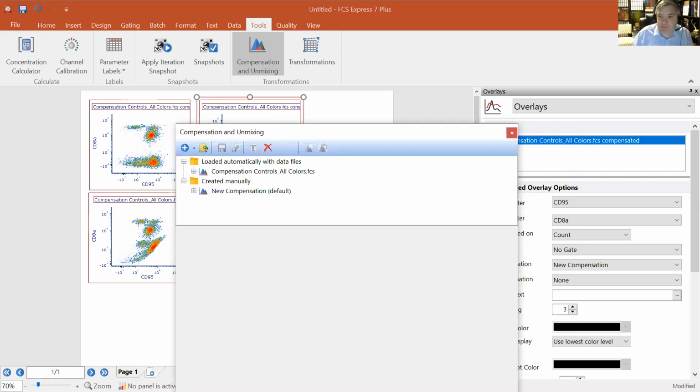One question that I have, and I'm not sure if it's a silly question, is sometimes people might have one experiment that they're running with two different tissue types that might have two different sets of compensation, right, with different parameters. Is there a way that we might be able to do that in one compensation window where we have different parameters for each one? So maybe one set has 7 colors that are unique, and then the next set has a different set of unique colors, or would that be a new workspace?